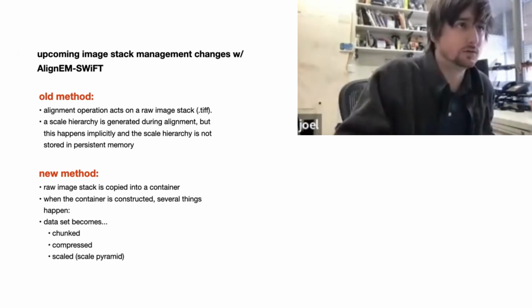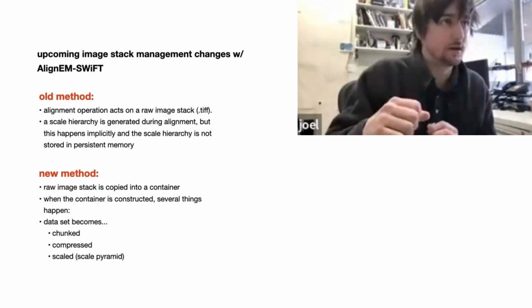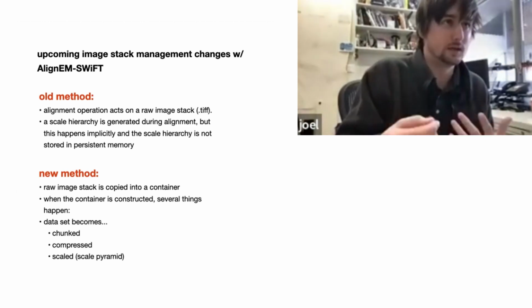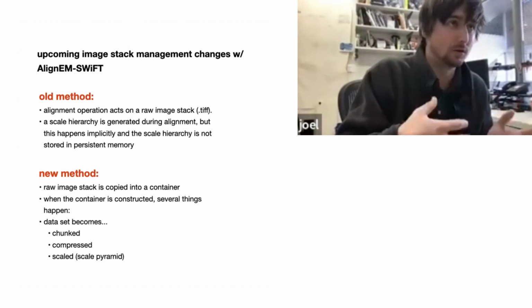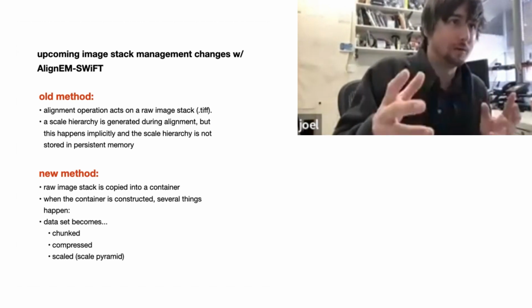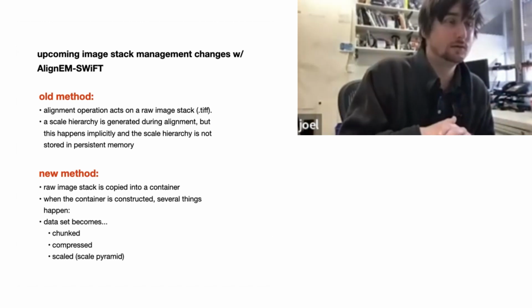The viewer is instantiated within a server that's serving it. What I'm going to show you today is that we're using the Python API of NeuroGlancer, which is installed on my computer. We're going to start a local web server on localhost, and then tell it where to look on my hard drive.